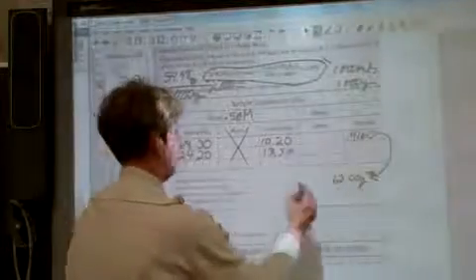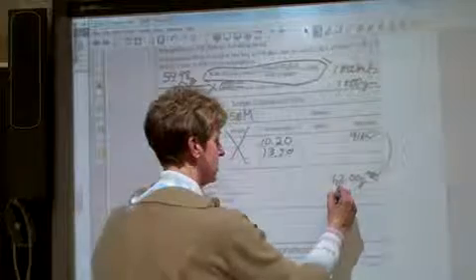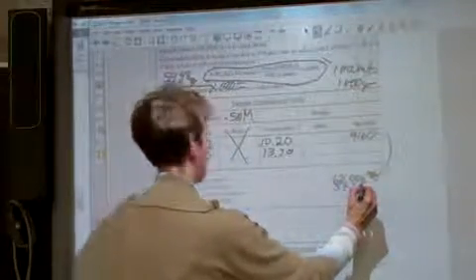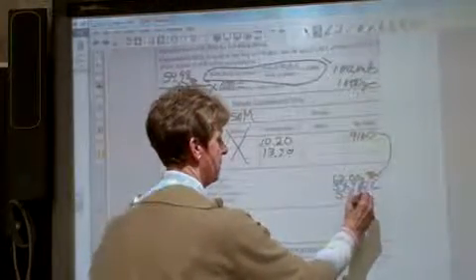Our next, what you're interested in. So where do all these values go? Now I want these numbers in here. So again, this group had 54.9 grams per liter, and that comes out to be 5.49%. All right? Here's what you should have had.